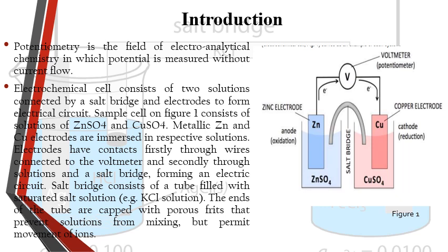Electrochemistry is a part of chemistry which determines electrochemical properties of substances. An electric circuit is required for measuring current. The unit for current is amp. And the unit for potential is volt, created by movement of charged particles. A galvanic cell, that is the electrochemical cell as in the figure, serves as an example of such a system.